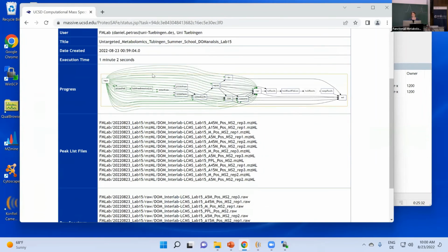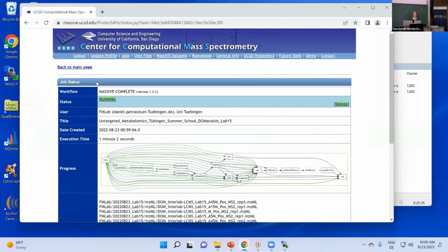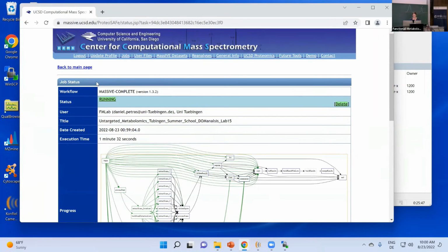We can show you once this is done that you have the option to add files or add metadata to your MassIVE data set. And then what will happen at that point is, I can pull up an example after, but basically you'll just see an updates folder. So it's less organized than if you'd added everything before, but there will be an updates folder, and then you can search for those new files in the updates folder. That's what I usually do.